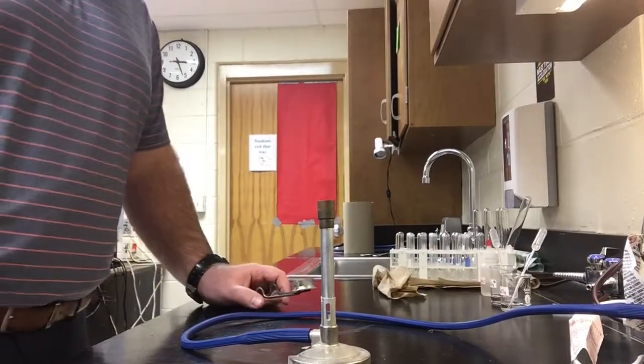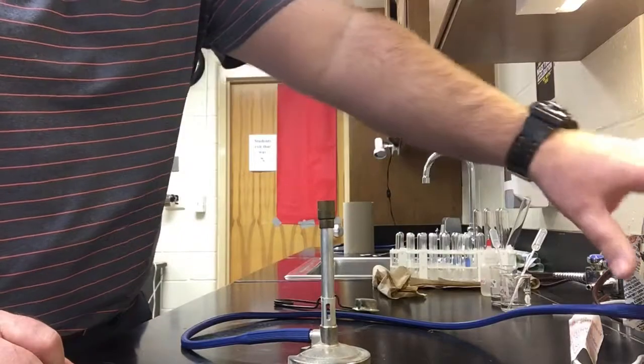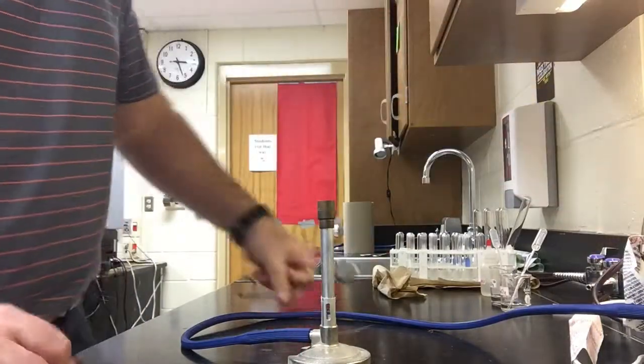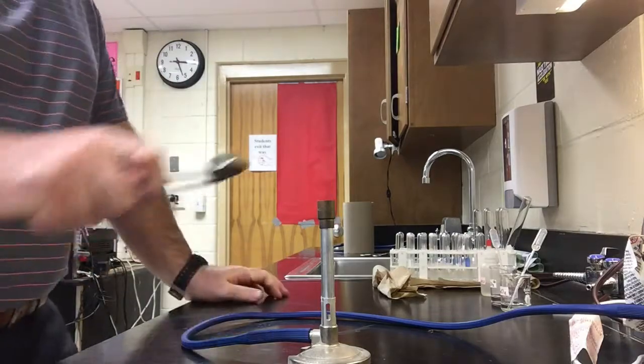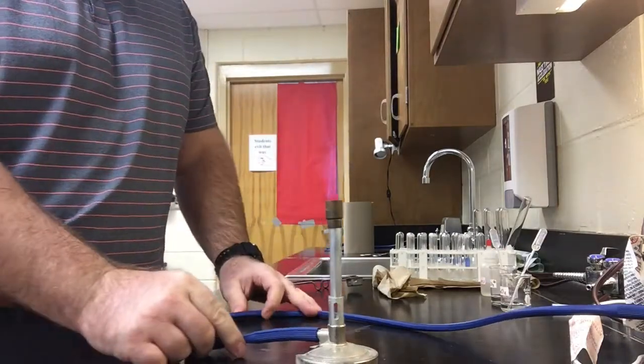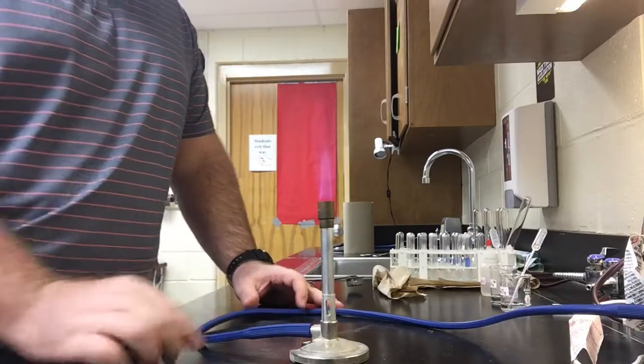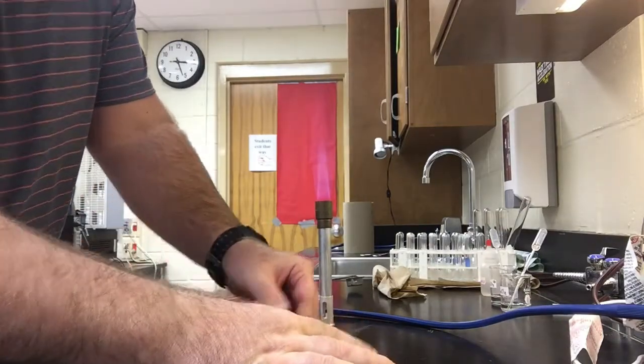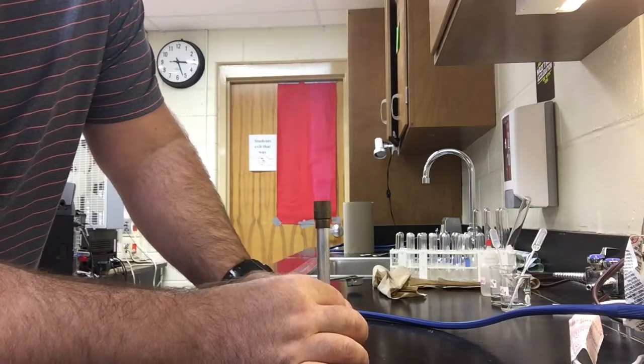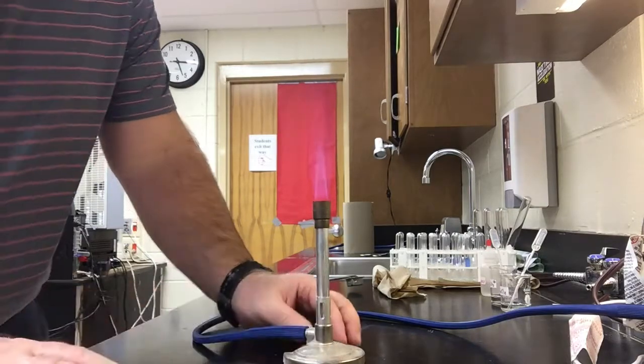All right, so today we're going to take a look at our types of chemical reactions lab. I'm going to start by turning on the gas to get the Bunsen burner going. All right, so as you can see the Bunsen burner is lit. You adjust the flames ever so slightly. All right, looks good.